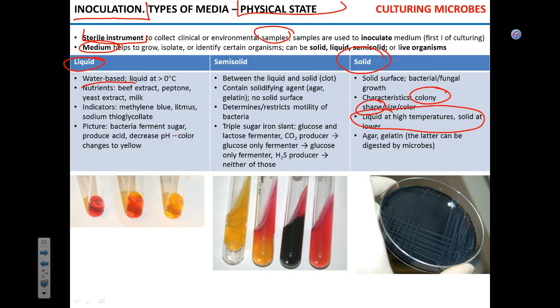Liquid medium is used for two main purposes. One, to grow huge amounts of bacteria. You can inoculate like a pint of medium, well, scientifically half a liter, okay? And you will have a load of bacteria, a lot of microorganisms.